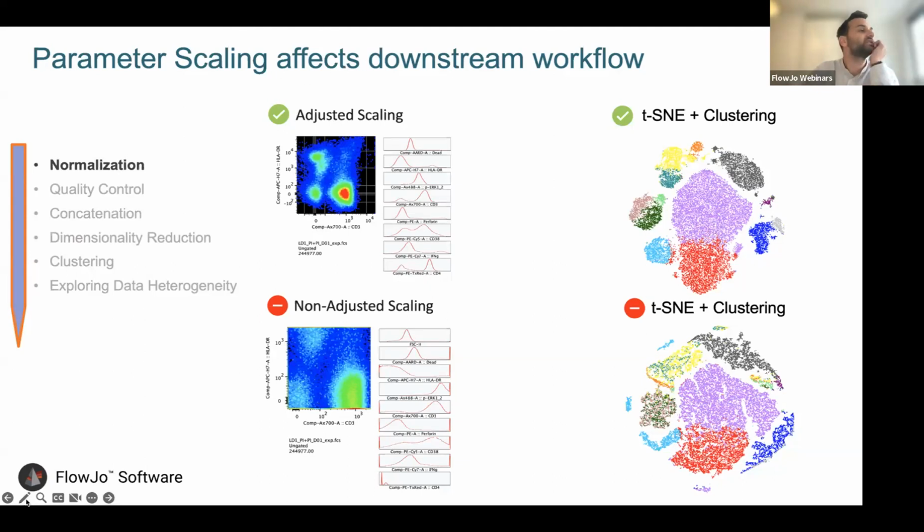I can take a question here. The question is, cytonorm and cycombine load all the samples to RAM, and in large data sets this can be a problem as you run out of memory. How would you proceed in this case?